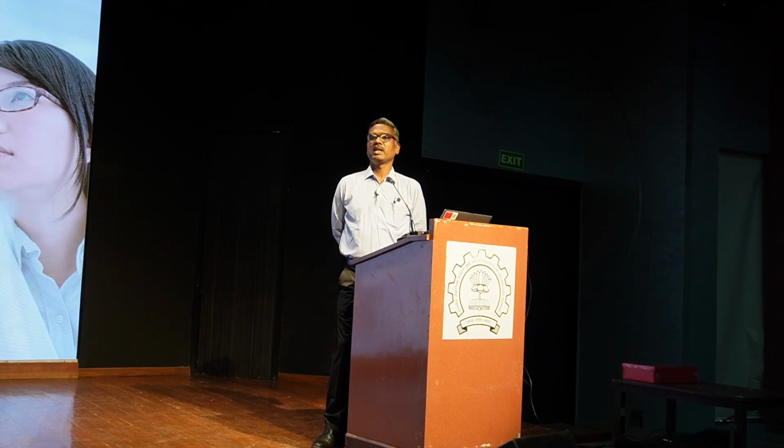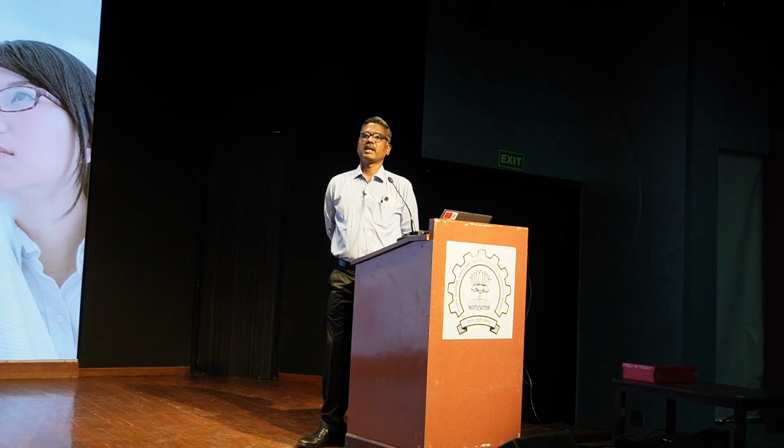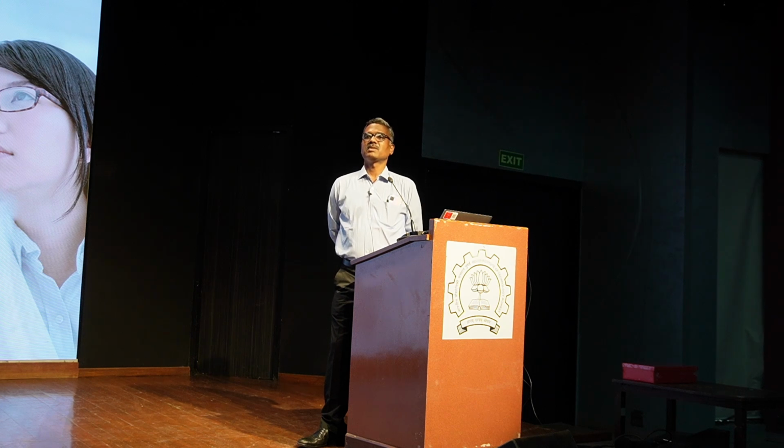So when developing any methodology, it should have competitive value, market value, so that tomorrow anybody can adopt your technique in their premises. That is very important. Your method should be cost effective as well as easily transferable. That is a very important aspect.